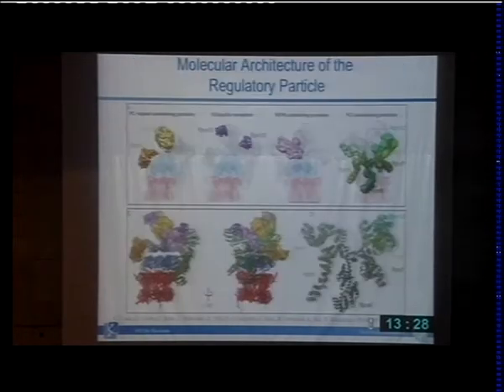and a little bit of uncertainty regarding RPN7 and RPN3. But basically, we now had the subunit architecture. RPN1 and RPN2 were located here, at the periphery of the AAA ATPase module. RPN13 and RPN10 were at the distal end. The MPN-containing subunits were here in the middle, and they were enframed by the 6 different PCI domain subunits.